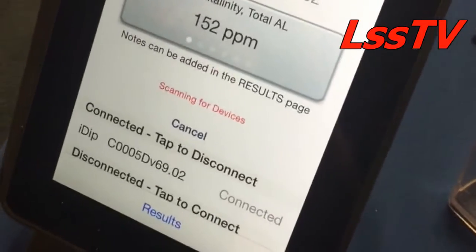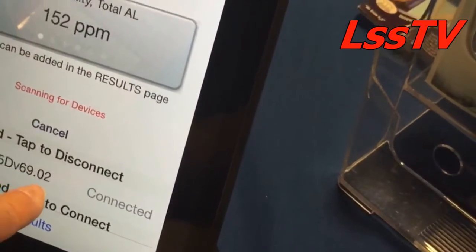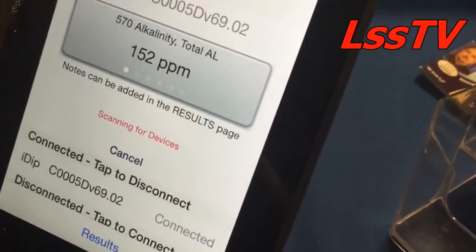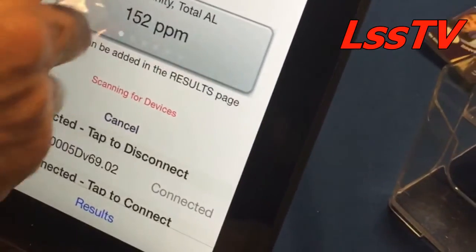This Bluetooth — I know you have an issue with the license — but this is the unique identifier: 5D. It's version 69.02. This is low energy. So here we are, these two are talking to each other.